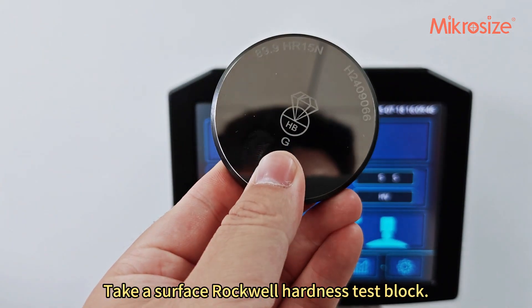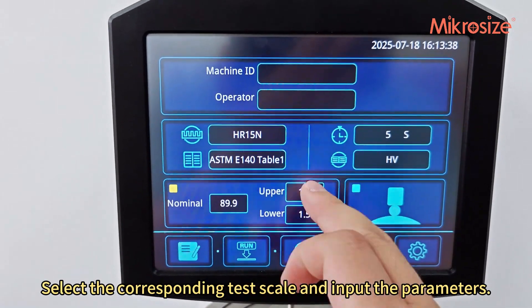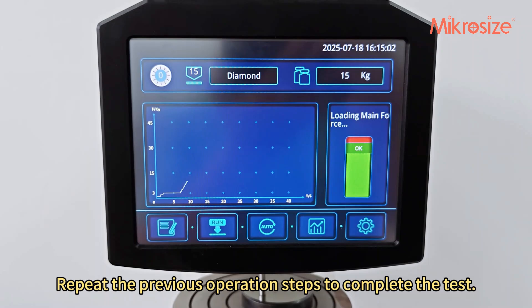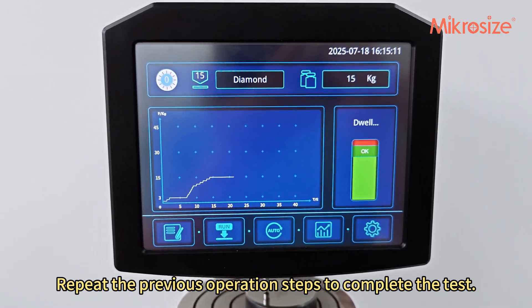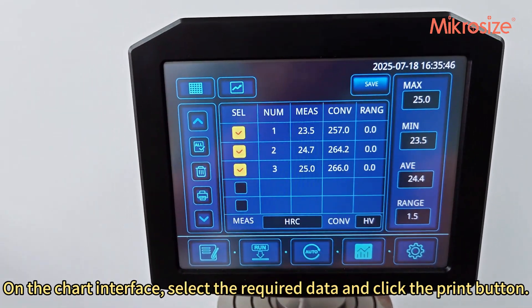Take a surface Rockwell hardness test block, select the corresponding test scale, and input the parameters. Repeat the previous operation steps to complete the test. On the chart interface, select the required data and click the print button.